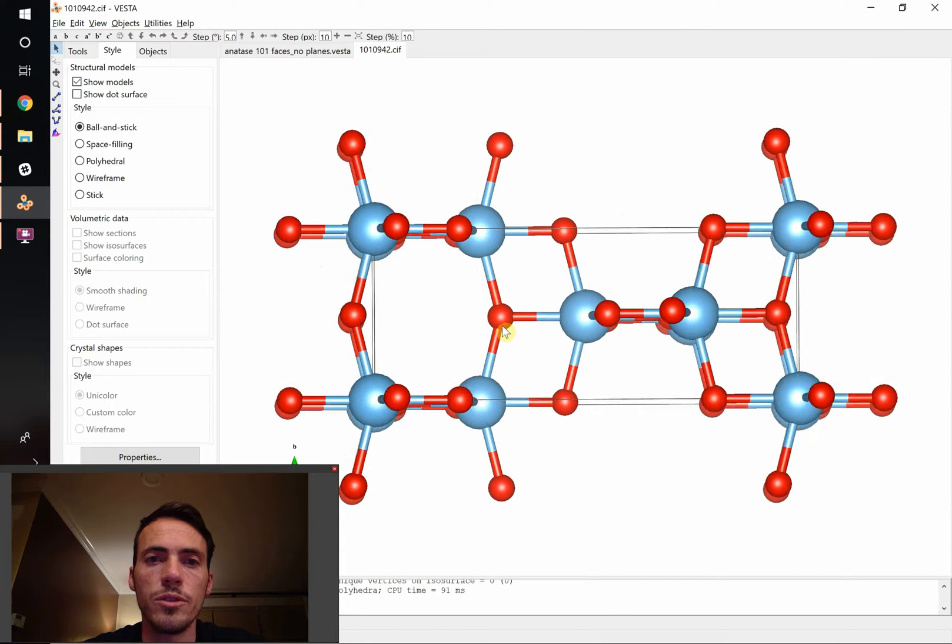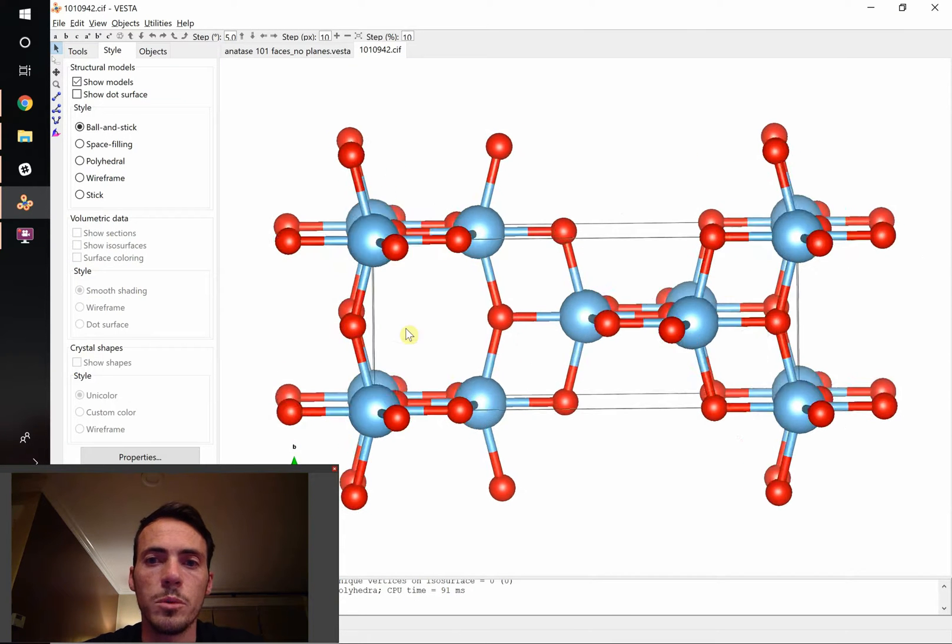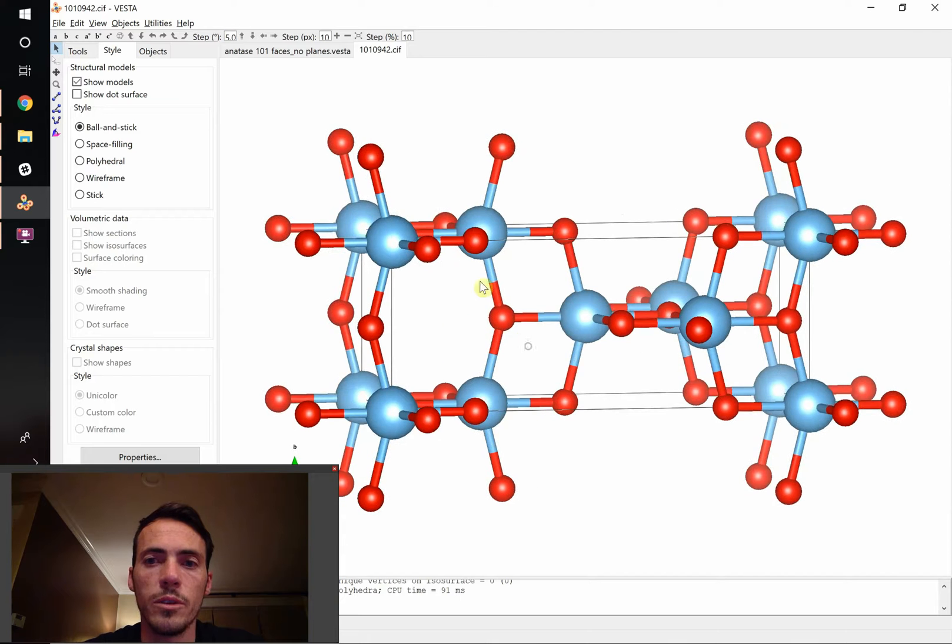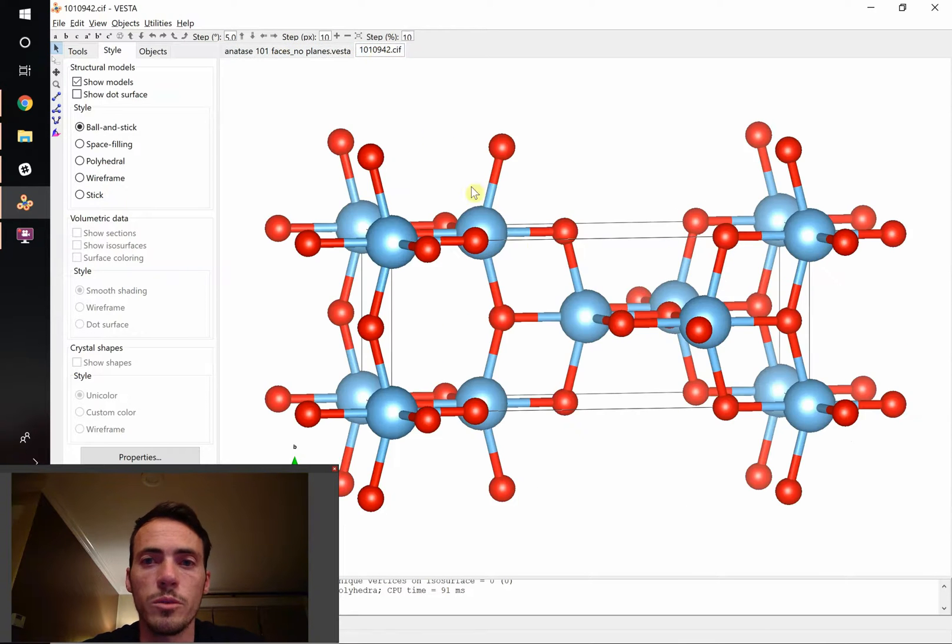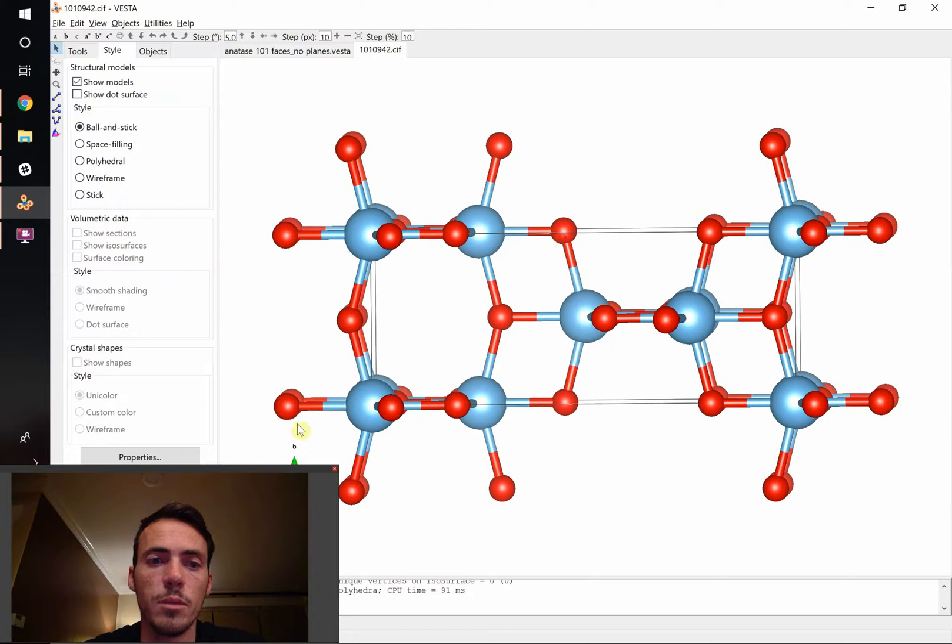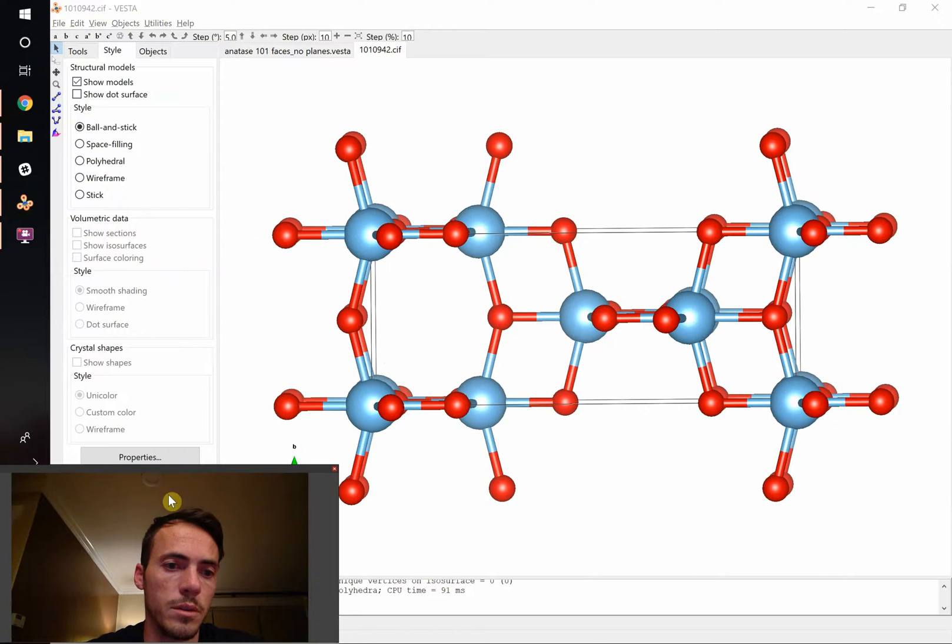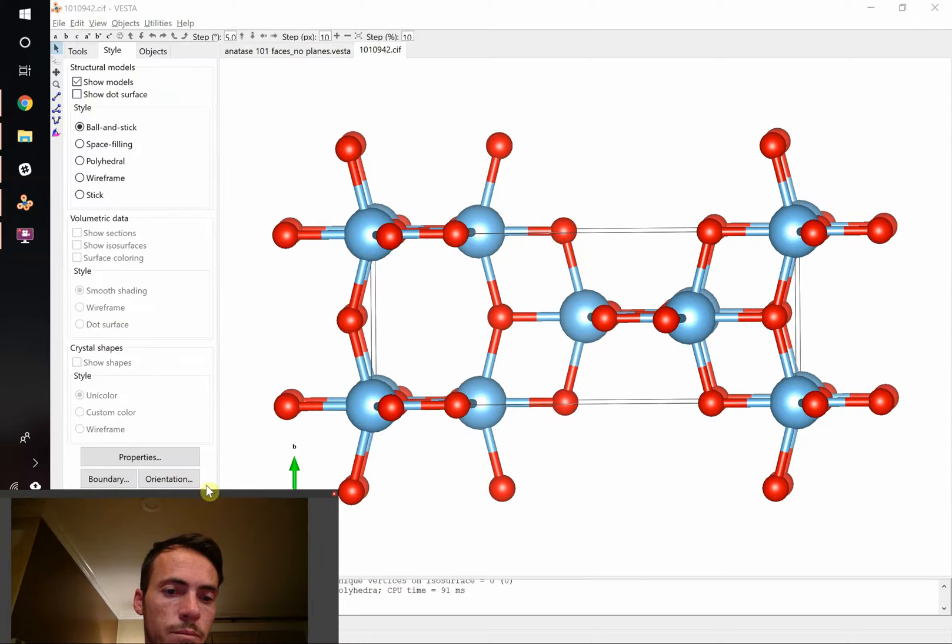So the first thing you notice, the difference between this and the one that we just saw there, is that it's much, much larger. So we know one of the first things we're going to have to do is extend our boundaries out.